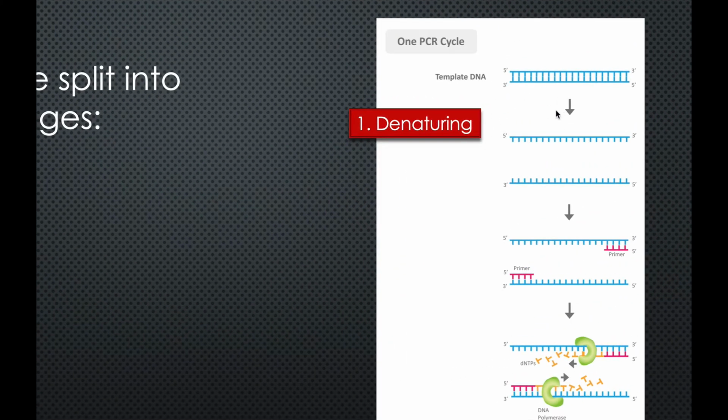What denaturing generally means is when something comes apart, usually biological matter, as a result of some environmental factor around it. Sometimes that could be too high a salt concentration, it could be a particular contaminant, but in this case, it's going to be because of heat. We're going to take apart this DNA strand from 1 into 2. We're going to separate it down the middle, and you can see that now we've gone from a double-stranded, double helix portion here to 2 single strands of DNA that are now separated.